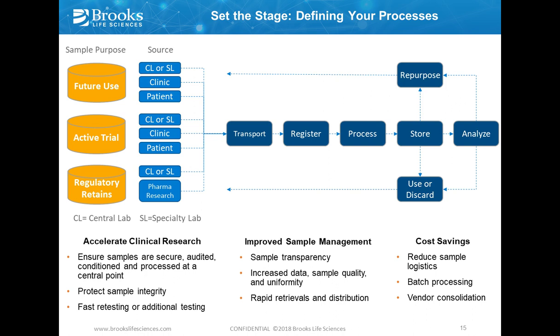Whether they're going to a central lab initially or specialty lab, or coming right from the clinic or patient to a biorepository, our overall processes are the same. It's about transporting the samples, registering them into a centralized system, processing, storing, and then analyzing either now or in the future.